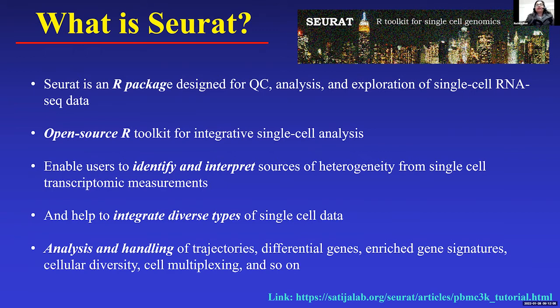This is an R package designed for doing quality control checks of the data that we have. We can do analysis and exploration of single cell sequence data. And it also helps in removing batch effects using one of the modules.